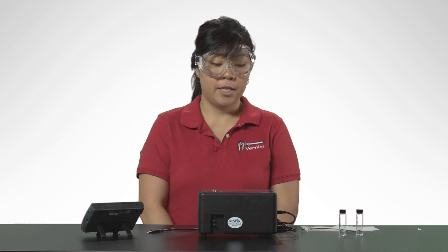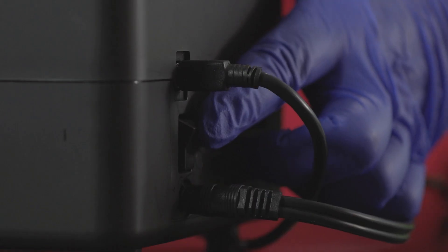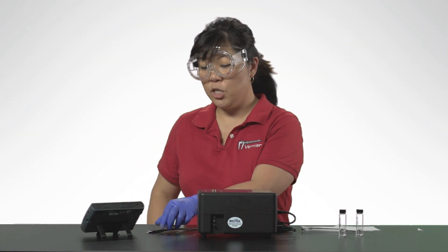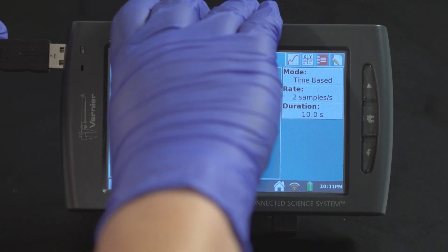Prepare the Mini-GC Plus for data collection. Connect the Mini-GC Plus to an electrical outlet. Turn on the Mini-GC using the on and off switch located on the left side. Connect the USB cable to the USB port of LabQuest.